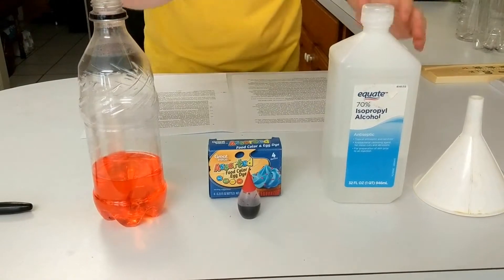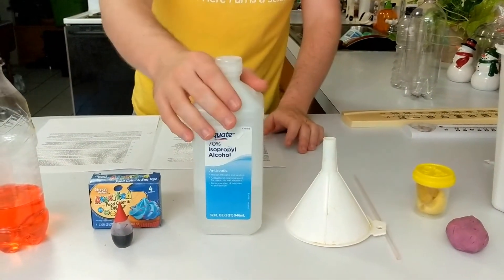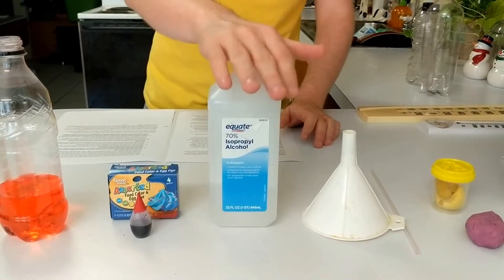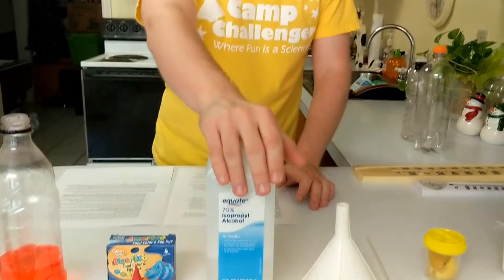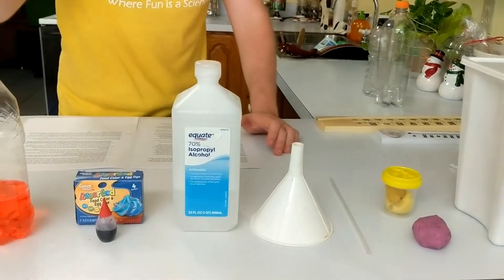You can use whatever color that you want — this is all up to you. Rubbing alcohol is our liquid inside our bottle. Quick note about this rubbing alcohol: safety first at all times. This is not safe to drink, don't be messing with it, work with an adult when using this. We also have a funnel if you have one at the house — that'll help you pour in the rubbing alcohol into the bottle.